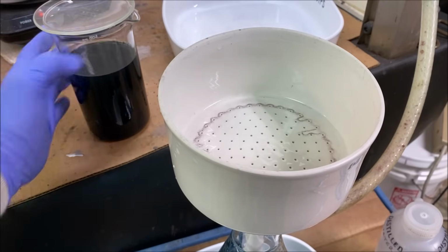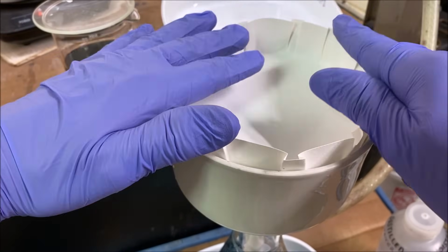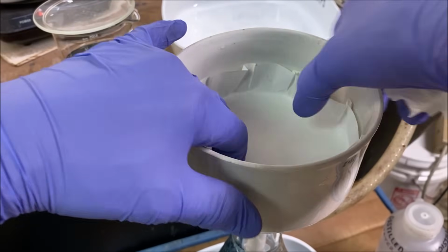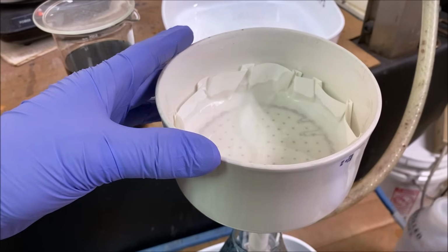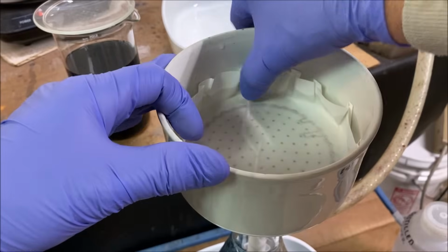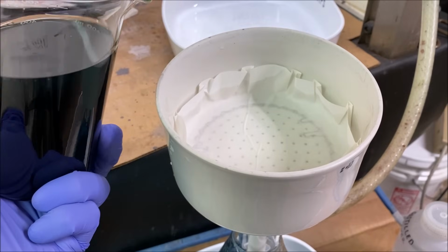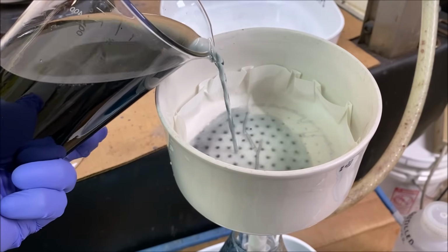Now, I don't know if this is going to be a mistake or not. We're going to try to filter these solids. The reason I'm fearful of doing this is because I had a filtering situation a few videos ago where it plugged the filter up. It took forever to pull through the filter. So we're going to take a chance here with this liquid that contains our solids. We're going to try to pour it through this filter and gather our solids in the filter. Here we go. Let's see what's going to happen.